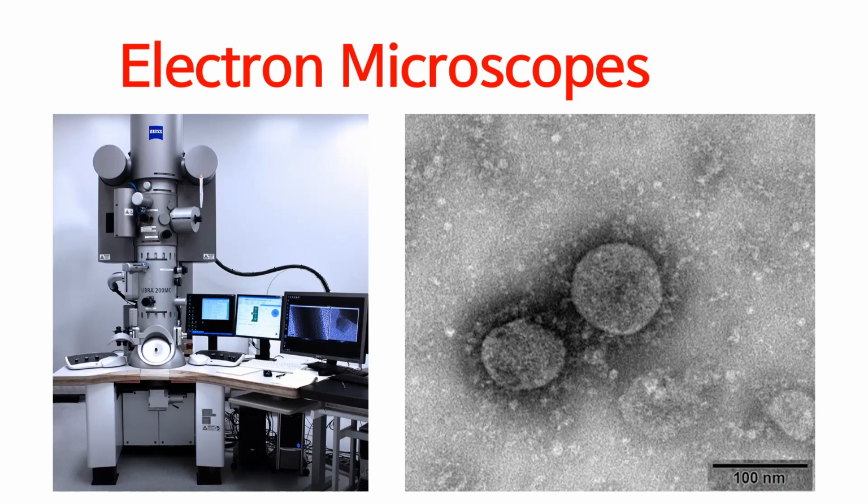By applying high voltage, we can accelerate the electrons and reduce their wavelength. We employ extremely fast electrons in the electron microscope to see an object. This lecture explores the basic principles of the electron microscope, which has a significantly higher magnification than an optical microscope.